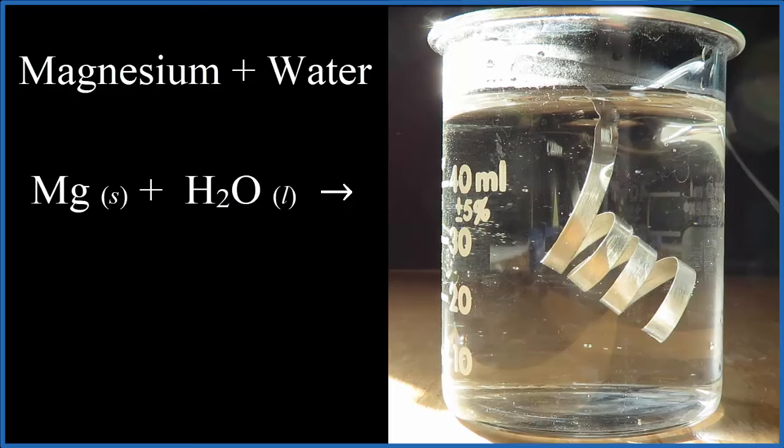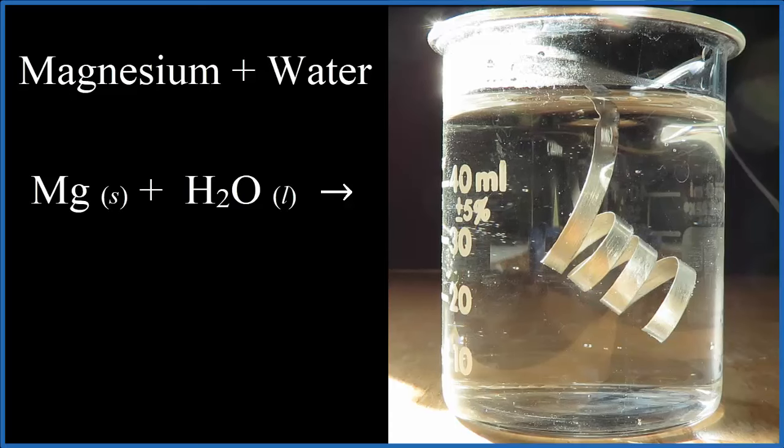Not too much happens right away. If we look closely, we might see some bubbles being formed. Let's wait, come back in a minute or two.